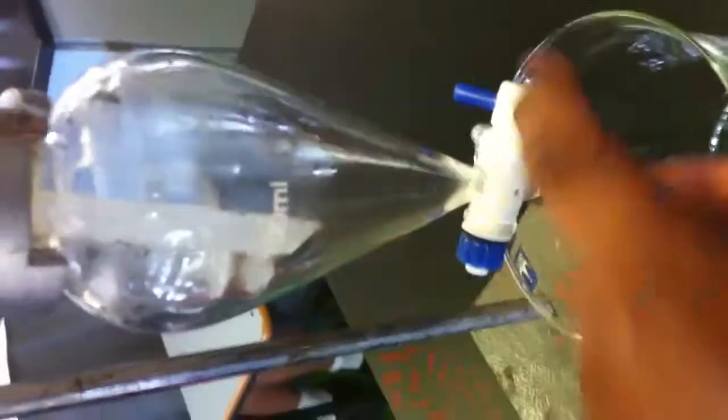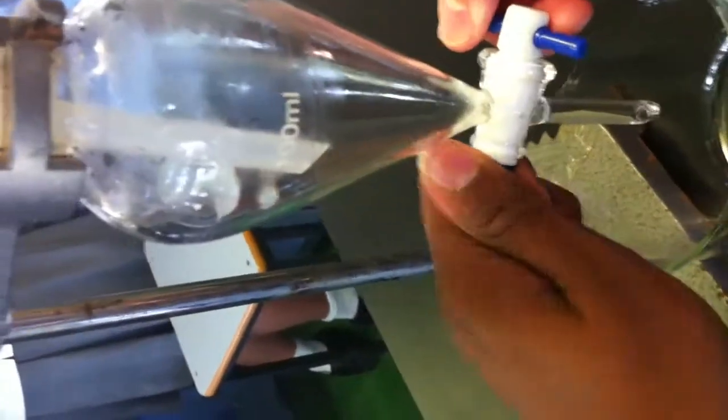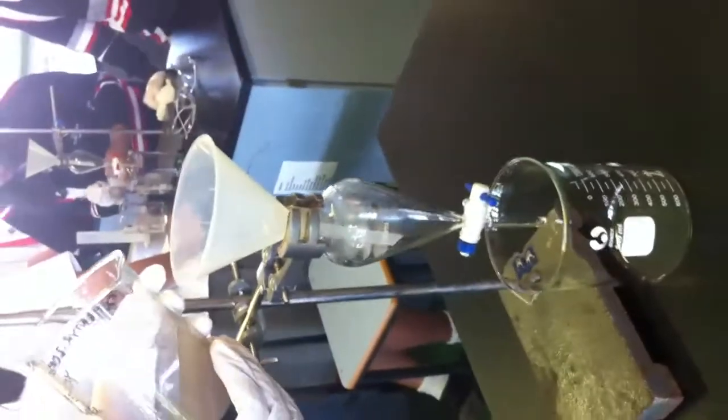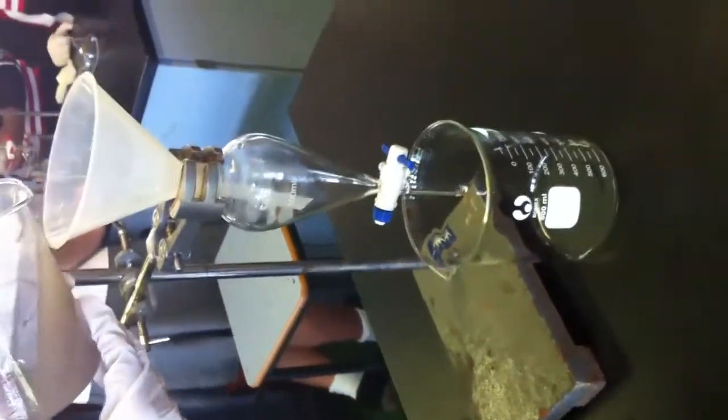Wait, Patrick, can you make it stop? Make that straight while I turn this. At least it opened up my nose. Okay. It should be closed. Not even straight to it. Go. Pour it. Use a stirring rod. Pour it. Hurry up! What are you trying to do? I'm pouring it.